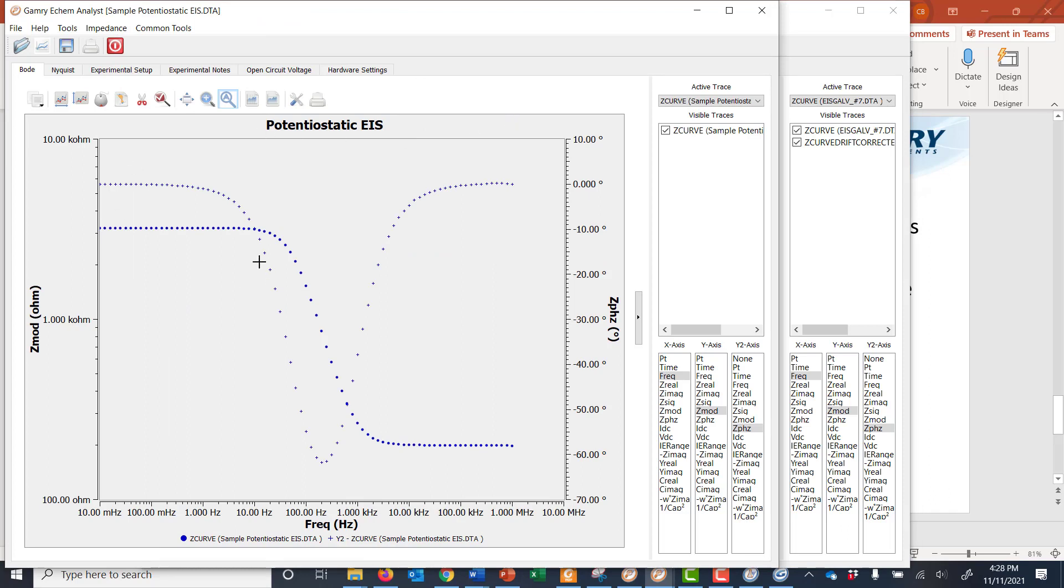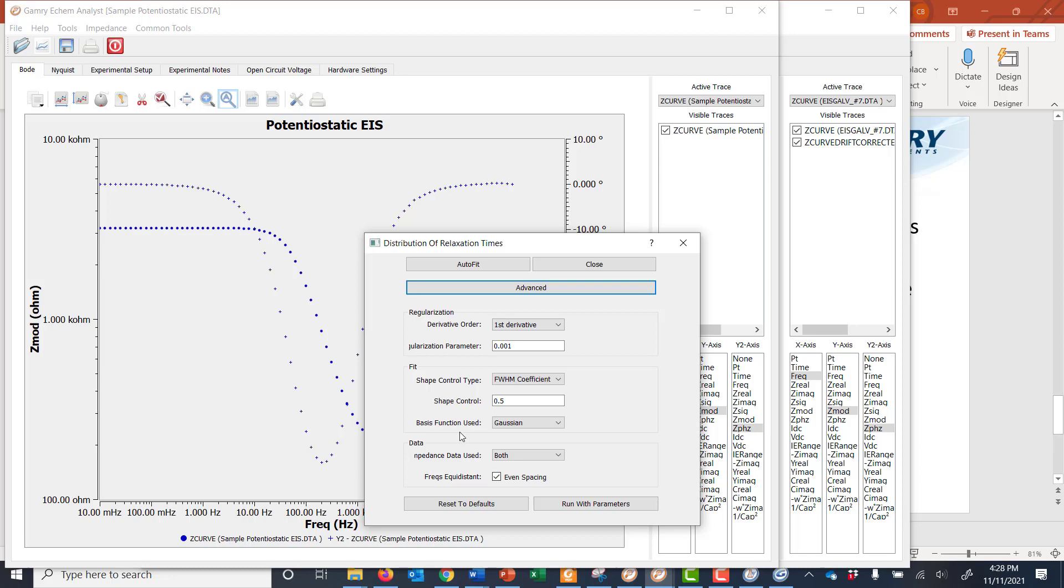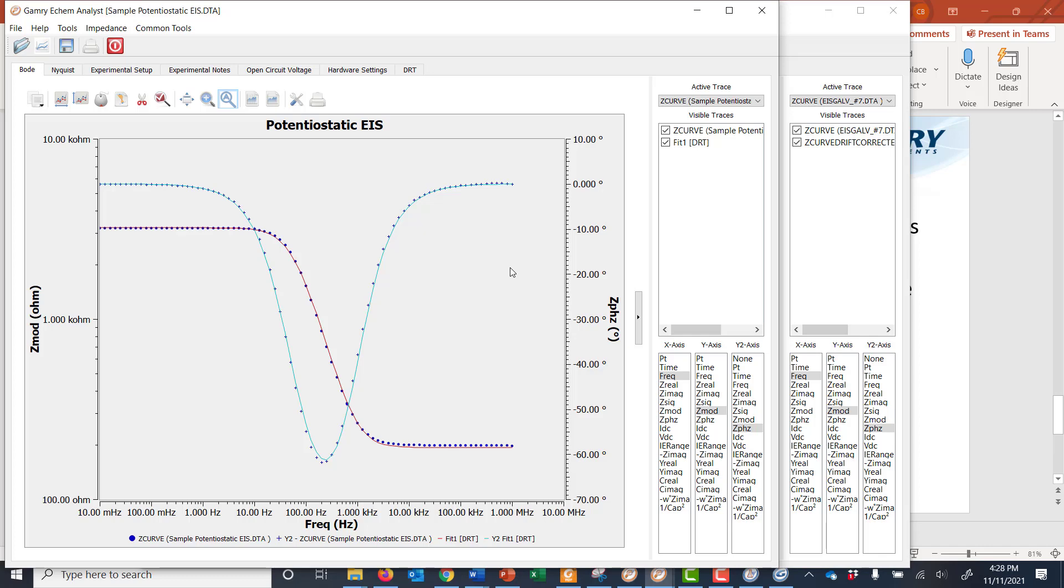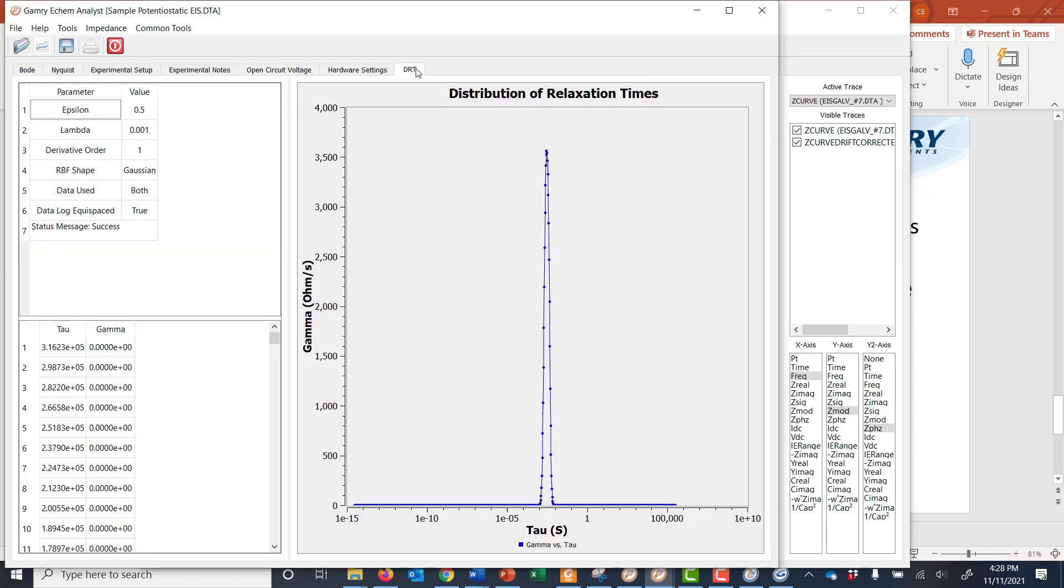And as you can see, this data is of a dummy cell. So a single RC time constant, dummy cell. It's a simplified Randles cell. If you go to impedance and you do distribution of relaxation times, you can choose to do auto fit. There are some advanced parameters that you can change here. But I'm just going to choose to do auto fit to show you what this looks like. We add a tab over here. And then we make a plot of the distribution of relaxation times. And so here's your time domain data. Single peak, single RC time constant.